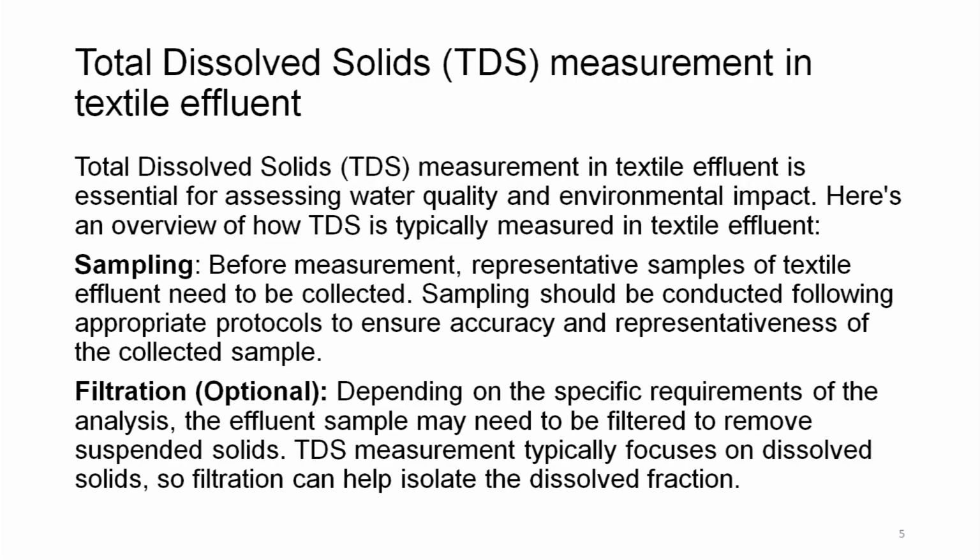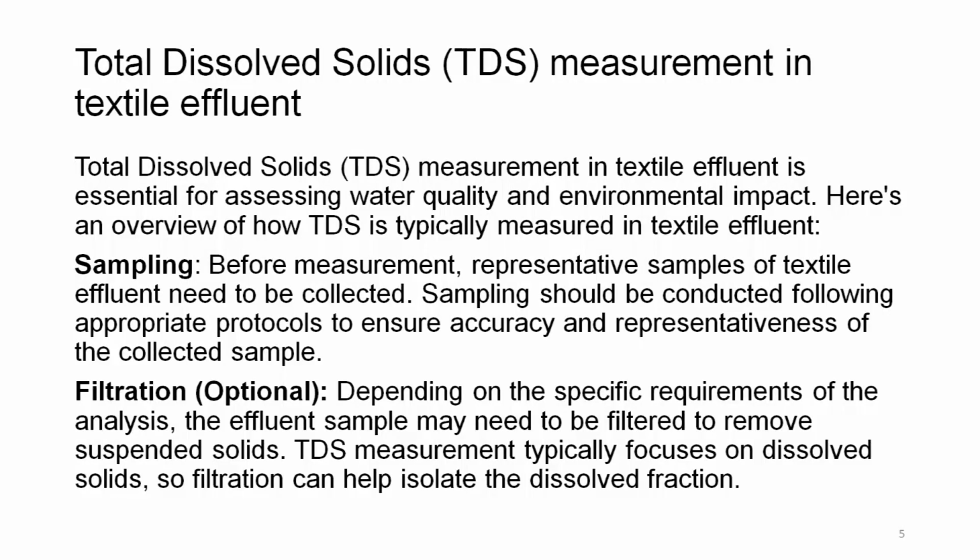This means that the sample should be very homogeneous and should be mixed properly, so that it does not have any kind of difference from the collection or sampling point of view. So, there are sampling protocols which need to be strictly followed. Filtration, which is optional.